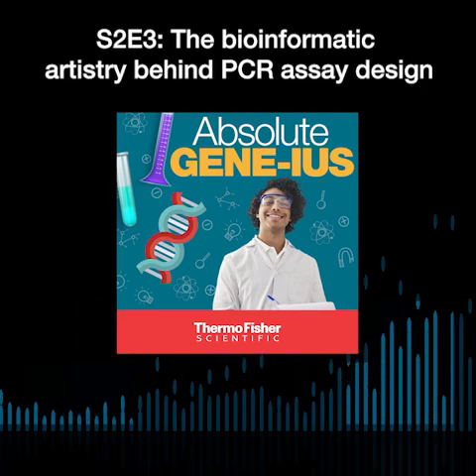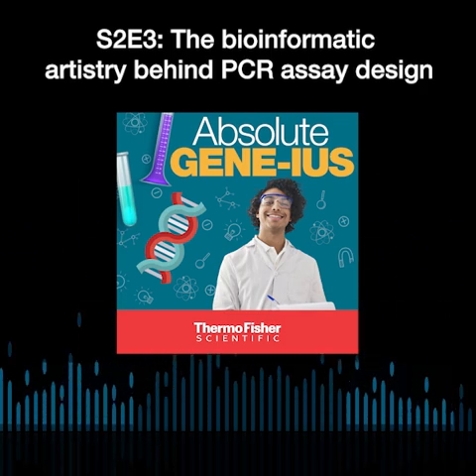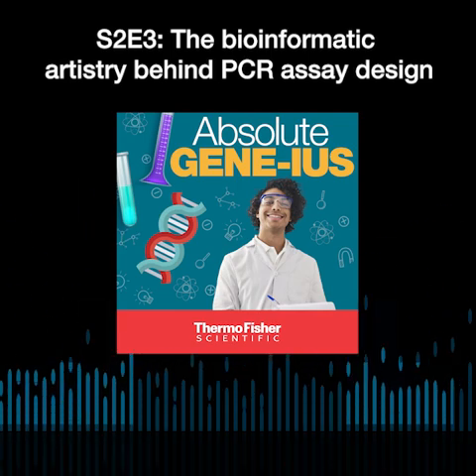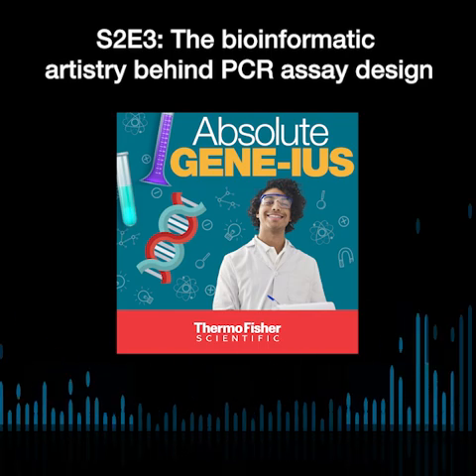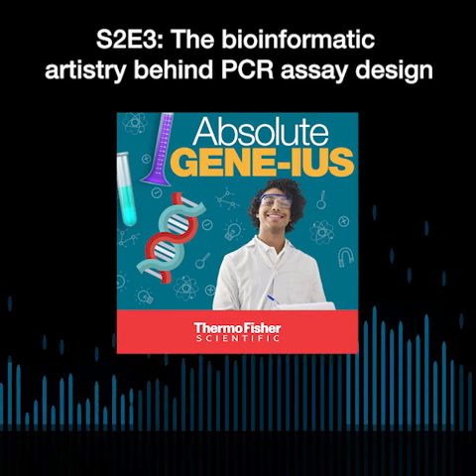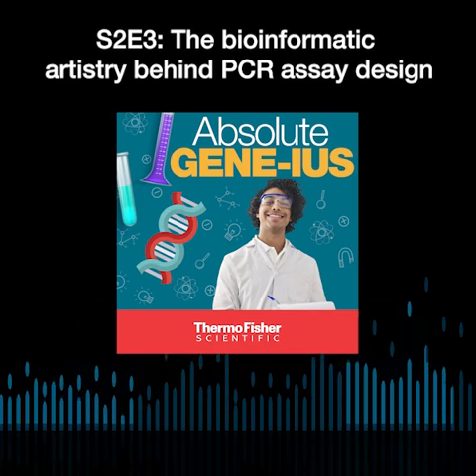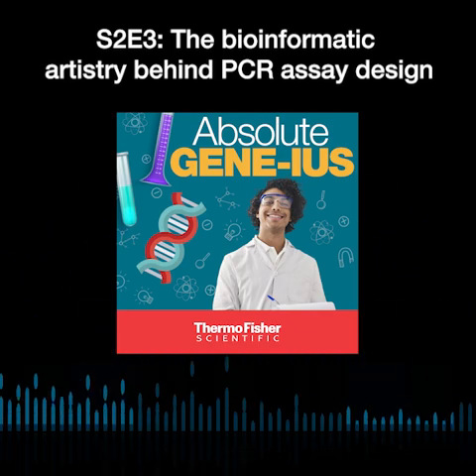Can you describe the role of a quencher when it comes to dPCR reactions? Basically, the quencher makes it so that the fluorescent dye will not fluoresce unless the probe is bound onto the target sequence, and then when the Taq comes by, it cuts off the quencher and the dye, I think, and then that's what makes the dye fluoresce.